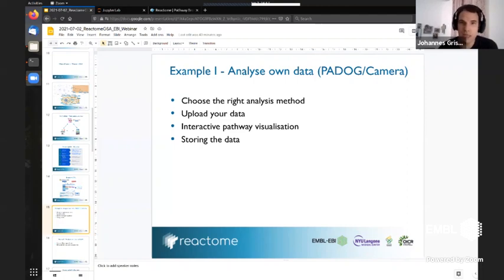We recognize this and the tool corrects for it. The expression values, since we're only interested in values for our statistics, are only added once. So this is taken care of. But all the isoform handling has to be done in the pre-processing pipeline.